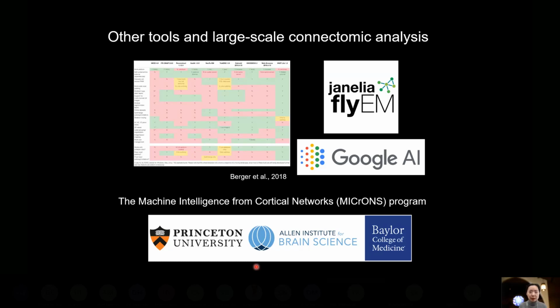If we want to use them, we still need to retrain the model for our specific data set, which will require high performance hardware to train those networks. In small labs, we don't really have access to those high-end hardwares.